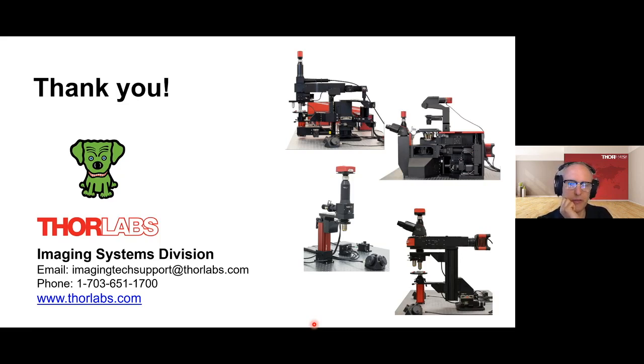The light will be in infinity space between the scan lens and the pinhole lens, and the pinhole lens will then focus that light. So you're going to be looking at the front focal distance of that pinhole lens is where the pinhole should be.